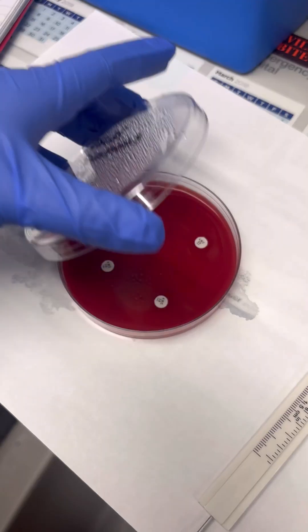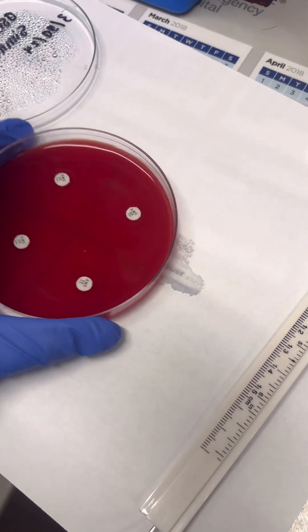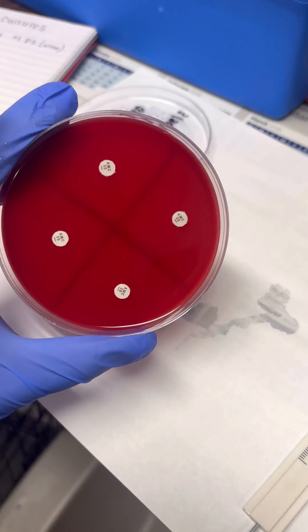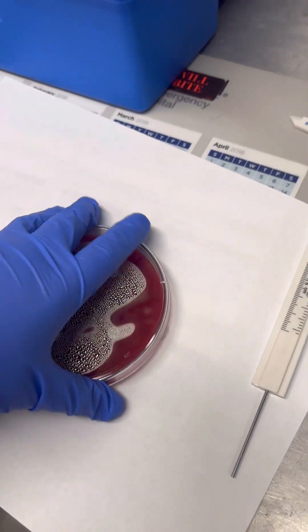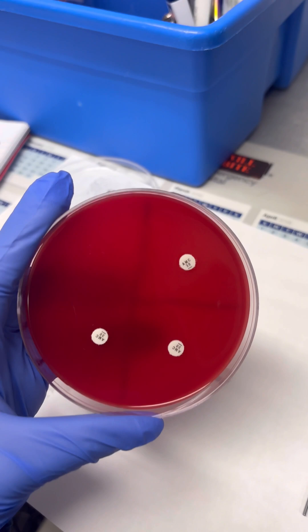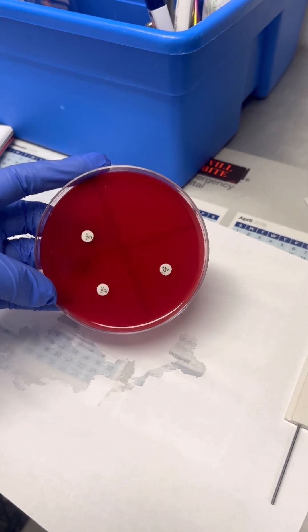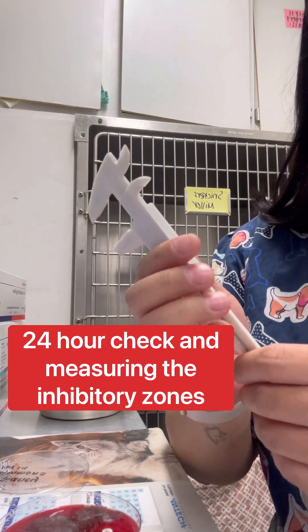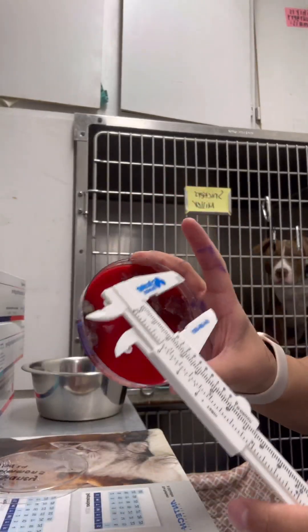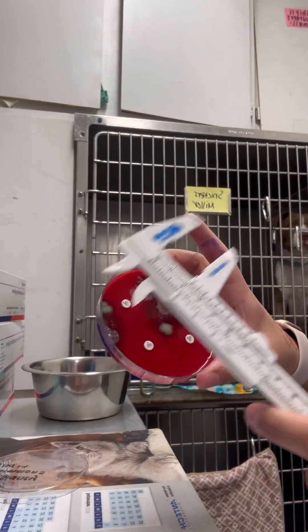This is another culture from urine — not very much growth on this one. And then lastly, my other culture with urine, and again not much growth. I'm going to be using these to measure the space around the antibiotic disc that is on my Agar plate.